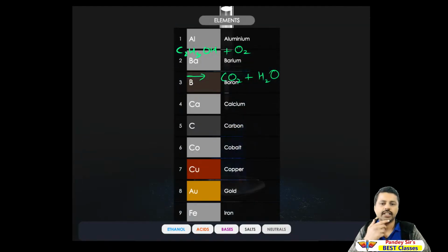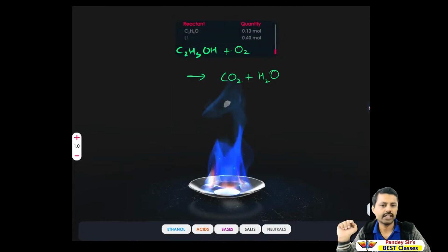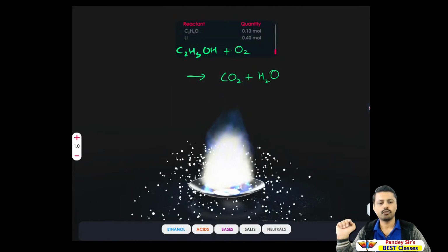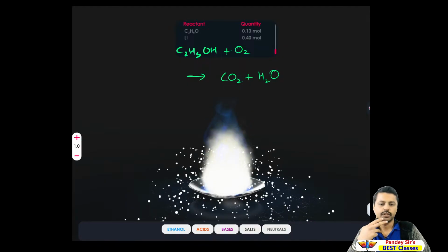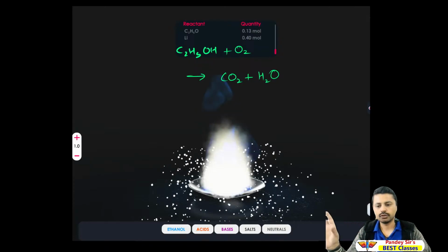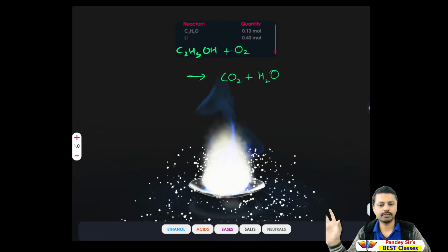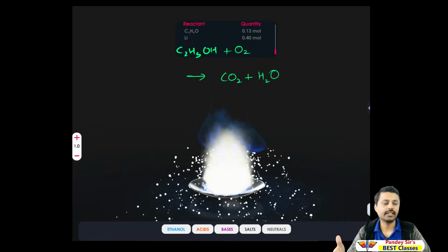So let's add a metal over here and see what happens. So lithium, the one in your phone battery. What will happen if I add this one? Oh my god. Wow. It's quite nice, but it's hanging also. But the reaction is very good. So you see the reaction, I'm very satisfied with it, and I'm going to end it now. So keep on practicing and bye.